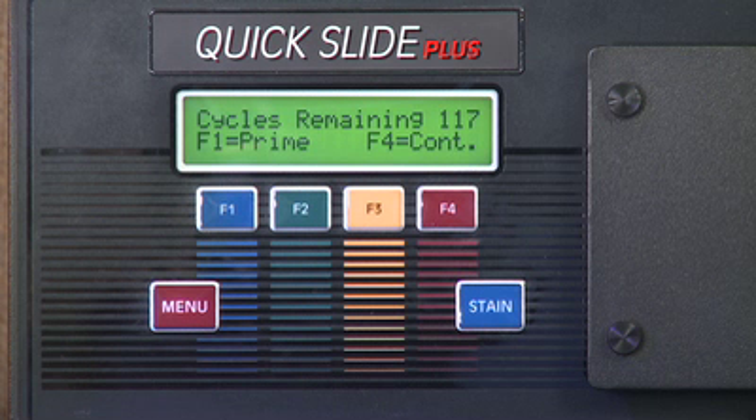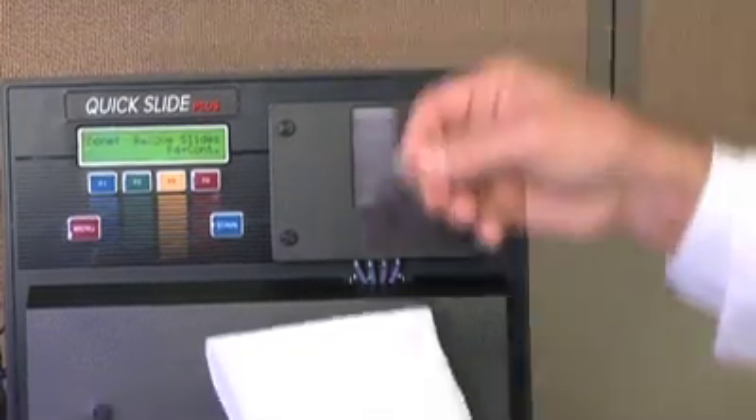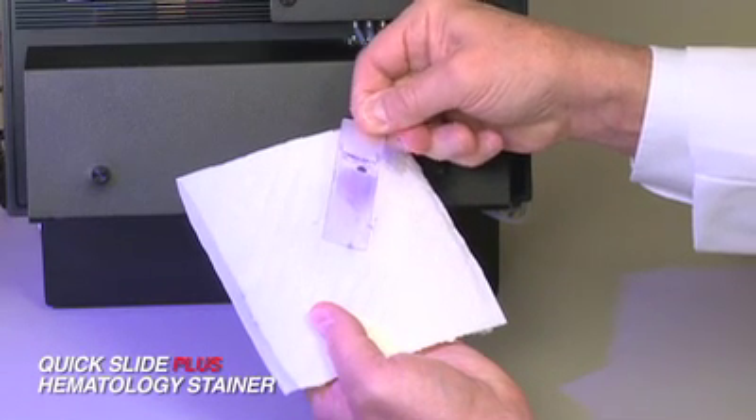Once the stain cycle is complete, an audible sound will tell you to remove the slide. Wipe off the back side of the slide, let dry, and you are ready to view. The stainer is ready to accept your next slide.